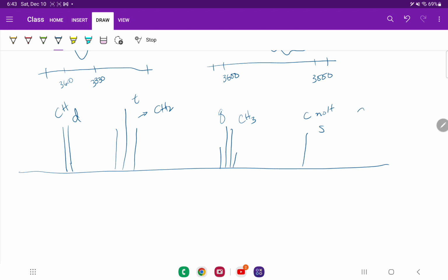Now, the coupled NMR, like I said, when we learned about it, is not terribly reliable. So we use DEPT to give that same information a little bit more reliably. So once you run your DEPT and you phase your NMR and all of that, which in lecture you wouldn't have to do, let's see what shows up on a DEPT 90.